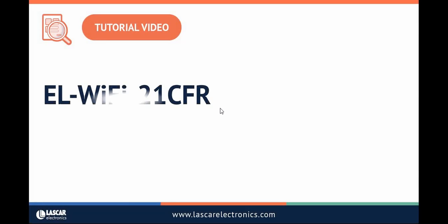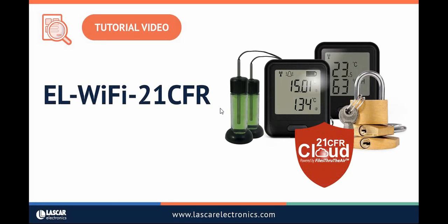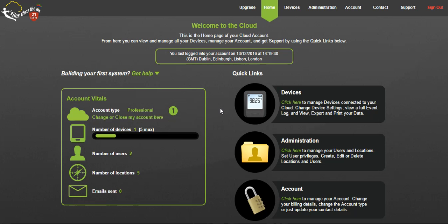I will now show you how to remotely manage and change the devices you've added to your cloud account. Firstly sign into your account. From the home page select the devices tab.